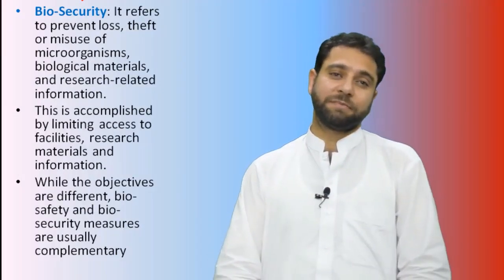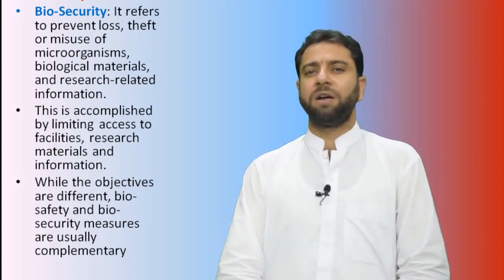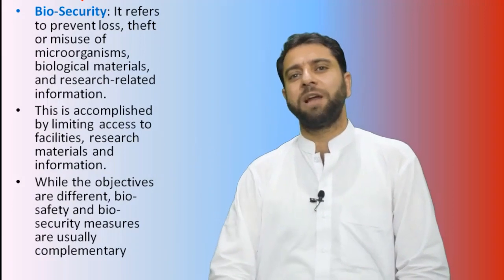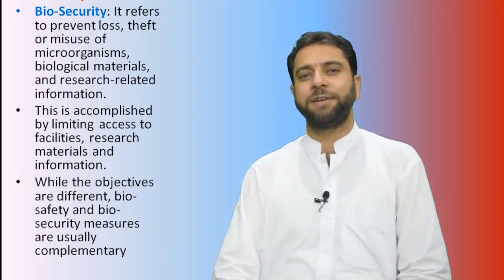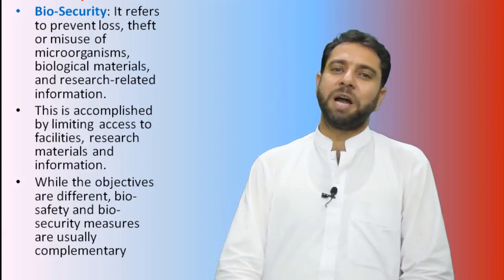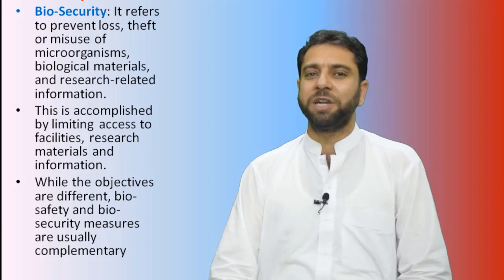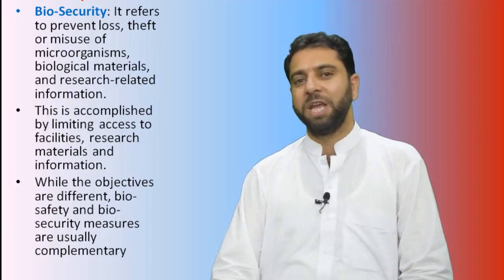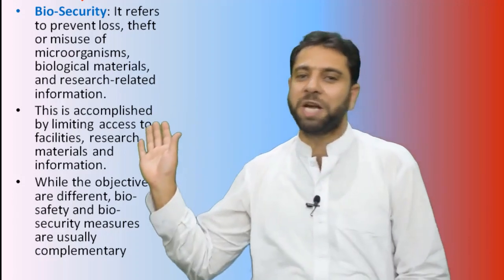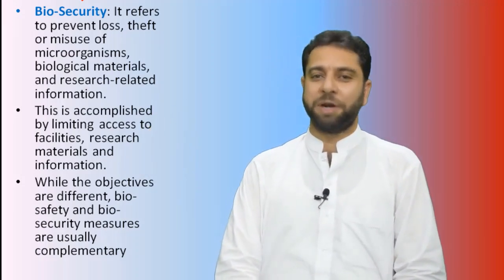Now, biosecurity refers to prevention of loss, theft, or misuse of microorganisms, biological materials, and research-related information. Biosecurity is accomplished by limiting access to facilities, research materials, and information. Biosafety and biosecurity measures are usually complementary, and both the terms share common components.